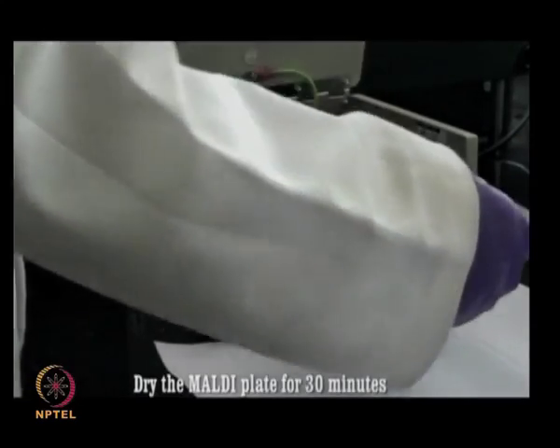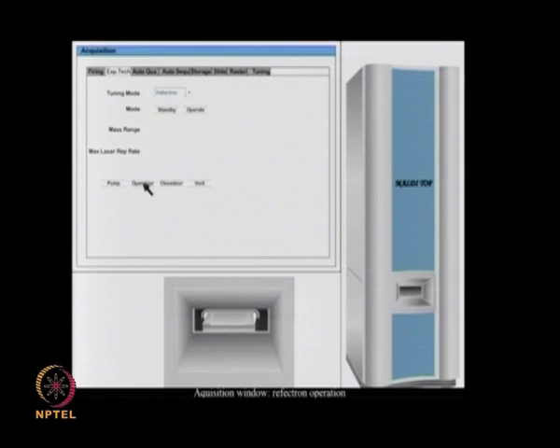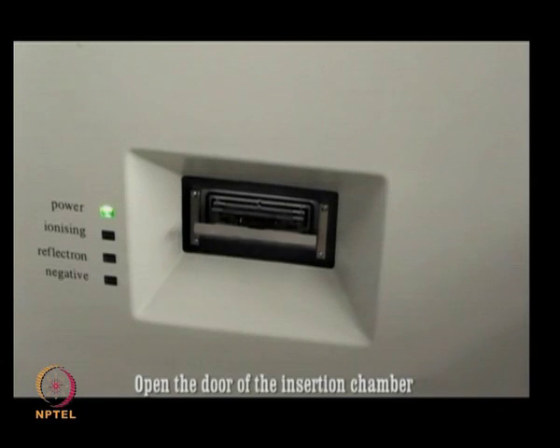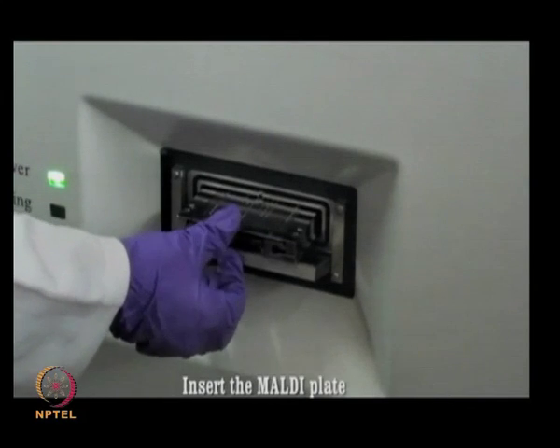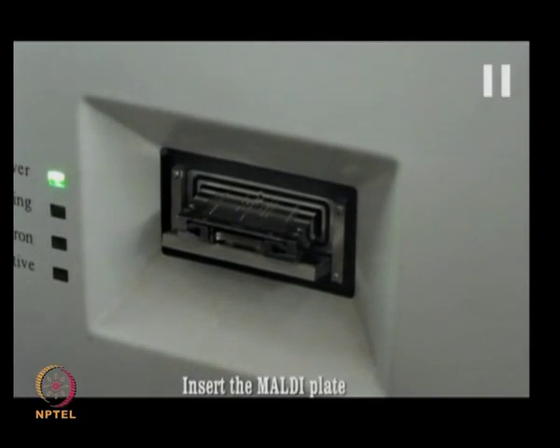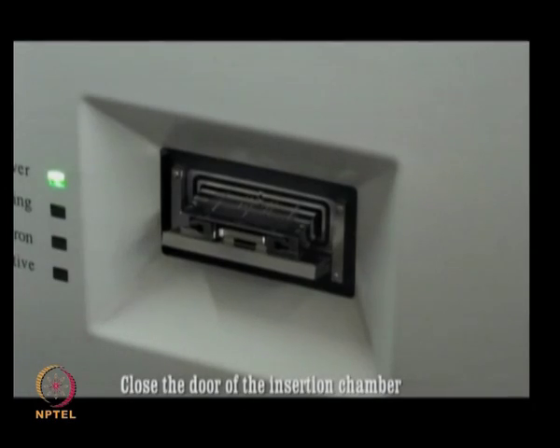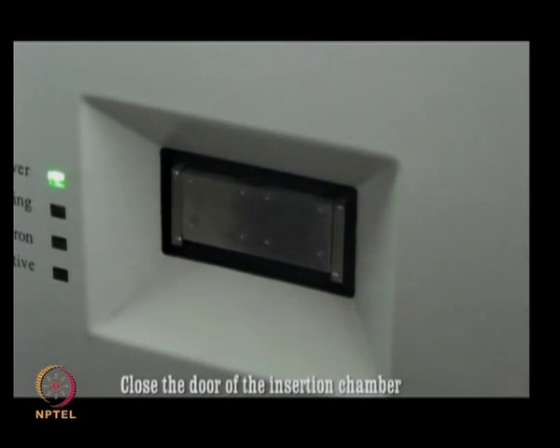While these steps are happening, you need to ensure that the instrument is on. So, click on the software, open the acquisition window, and then click on the open door. Insert the MALDI target plate, face up with the cutoff corner to the front, and now, by using the software, close the door. The door of the insertion chamber is now closed.